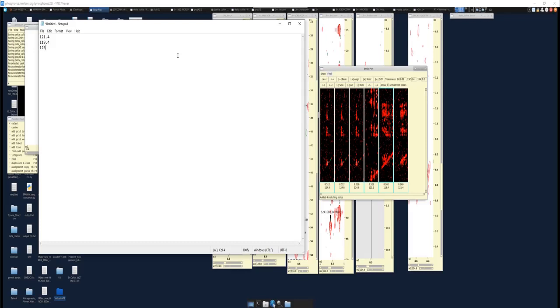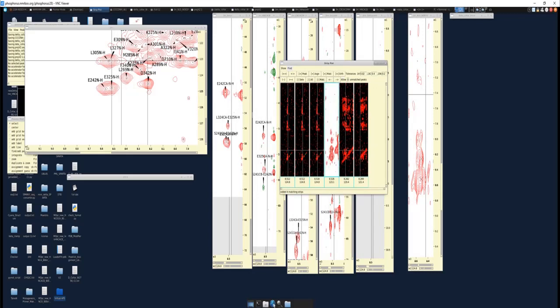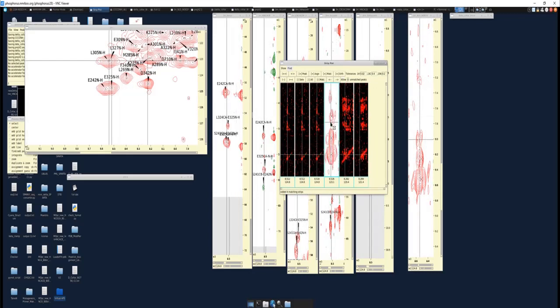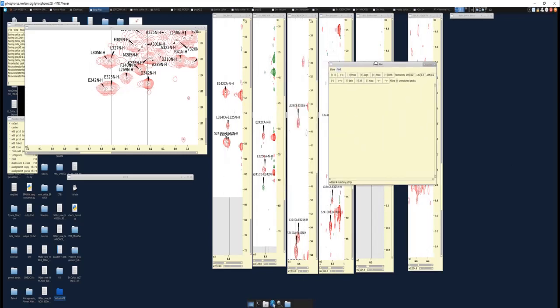119.4, 123.1. So what this is saying is that every single NOE strip here, so let's bring this here, let's click CI so you can see better. Basically what this is saying is every single NOE here has a match that connects back. So it contains these 2. So this might potentially be searching for an I-1 or I+1. So now we used our NOE, we have 3 potential matches.